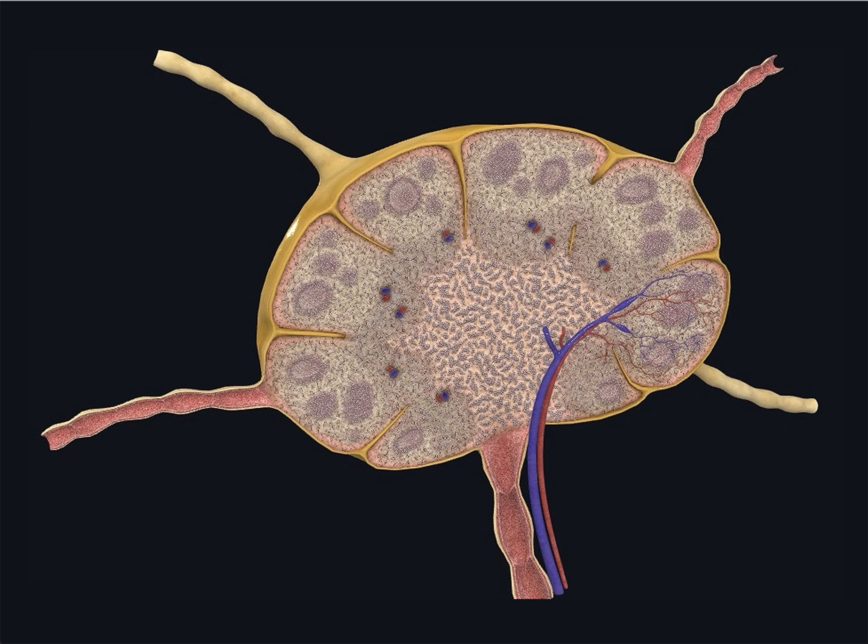The medulla contains cords of lymphatic tissue, represented by these darker coloured components, separated from the lighter coloured region representing the medullary sinuses.